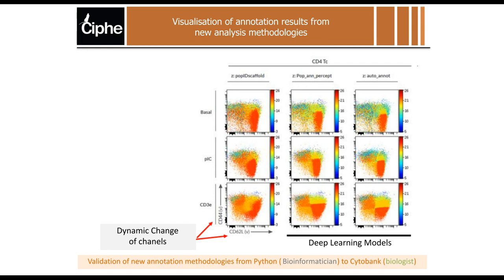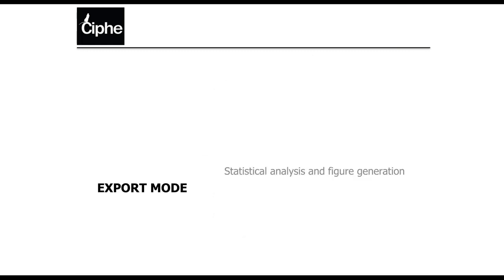Right. So that's a very nice way to work between two expertises, bioinformatician and biologist. I have to say that there is an API that we don't use at CIPHE, but that also allows the bioinformatician to run analysis on Cytobank directly from R.